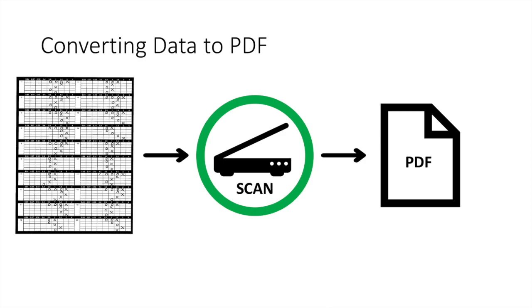After completing the datasheet for all animals tested, simply scan the datasheet to a PDF. Do not use a phone to take a picture of the datasheet.